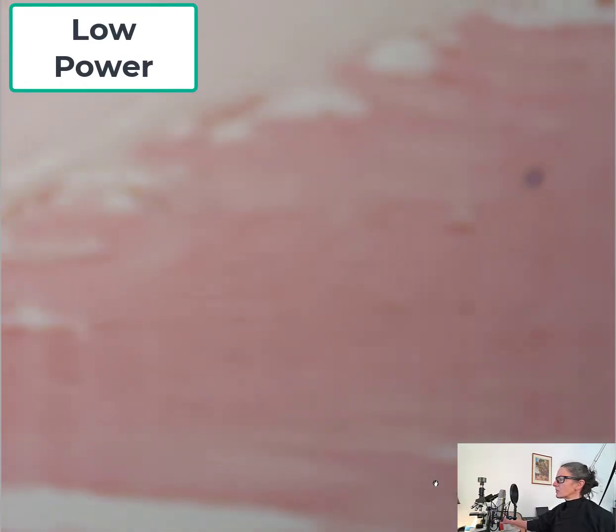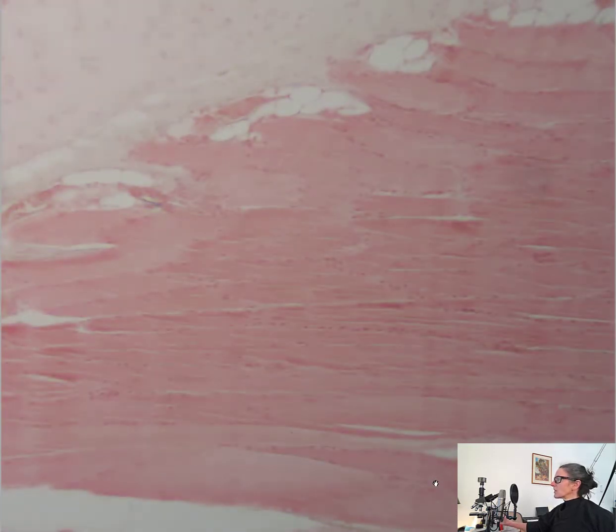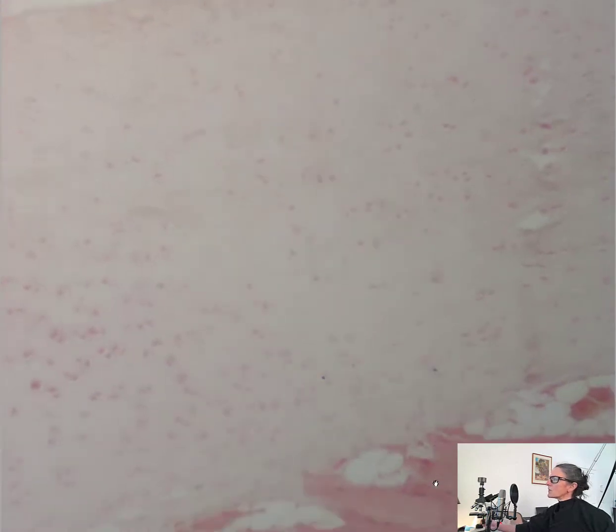And one of the first things we see is we're not even on hyaline cartilage anymore. This actually is skeletal muscle. So what I'm going to do is move our slide to where we have the cartilage in view. So what we'll see are these little things that look kind of like bubbles, and inside the bubbles are these cells. The cells are what we call chondrocytes, and they maintain the surrounding matrix.